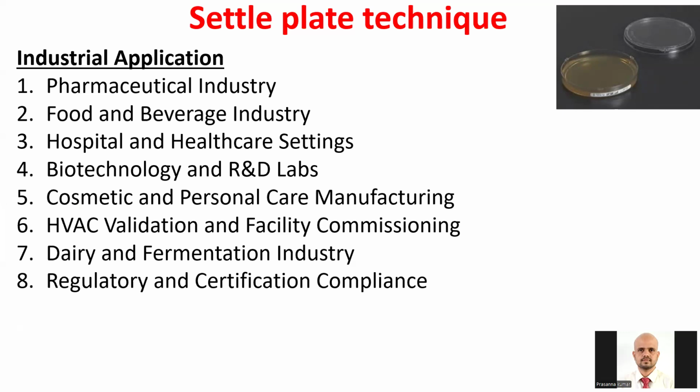Pharmaceutical, food and beverage, hospitals, biotechnology, cosmetic, personal care, and many more industries use it. In the pharmaceutical industry, for example, they are used for clean room validation and monitoring, and for aseptic filling areas. Even in good manufacturing practice, the settle plate is the first technique. If you are a technician walking into a pharmaceutical industry, this is usually the first thing they will do. They will do the settle plate and study the colonies the very next day.